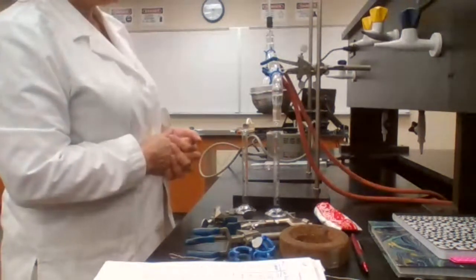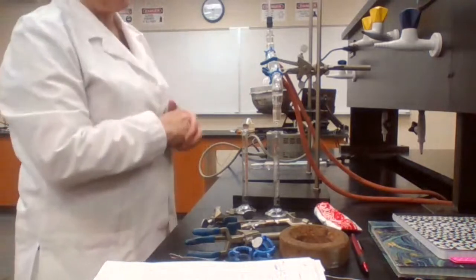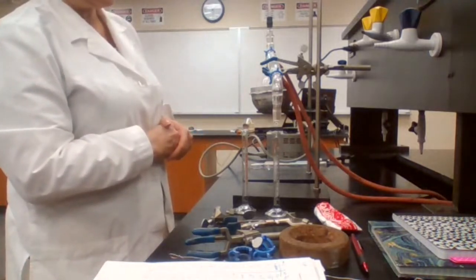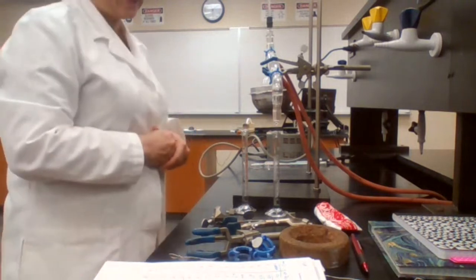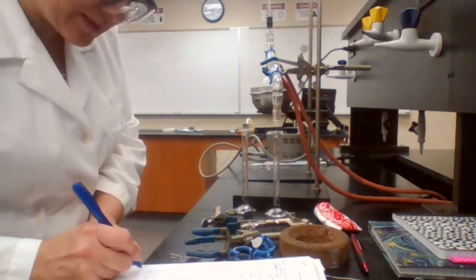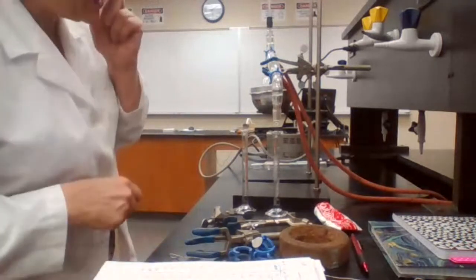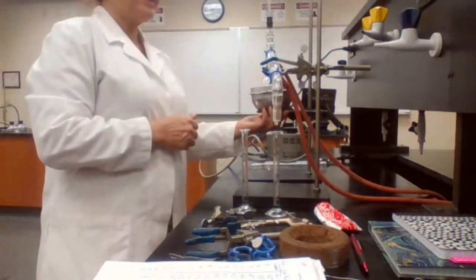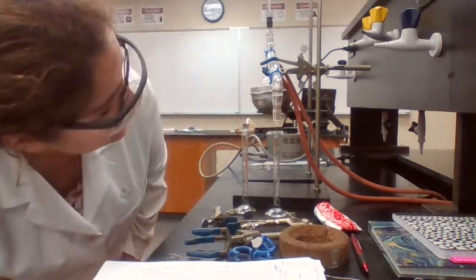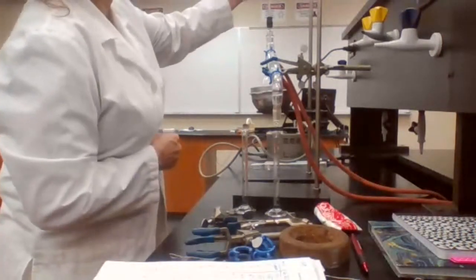It kind of dries up, or it could be that now we have a better sealed system because I've made sure that it is sealed. But when we were working with the students, we never went past 14, which is okay, which is good. But we should not aim for 20 milliliters, because if you recover 20 milliliters, that means the flask is completely dry, and distillation should never go to dryness. 16 milliliters, 79.